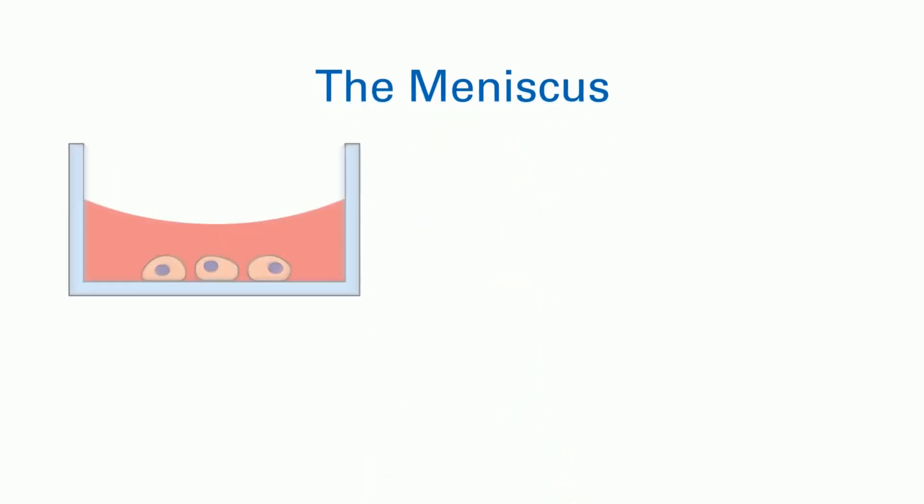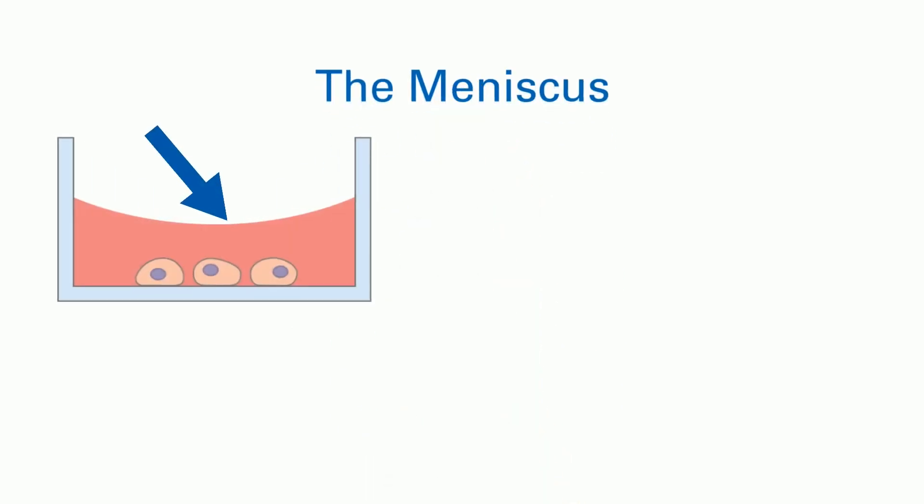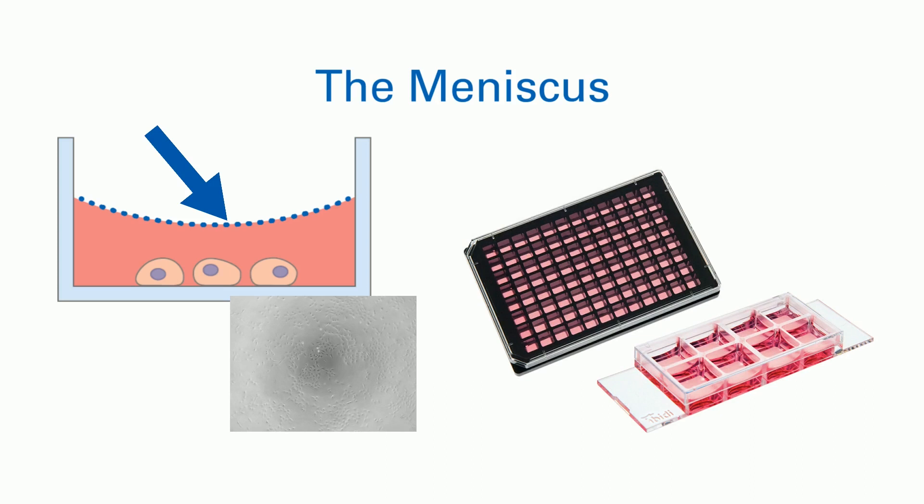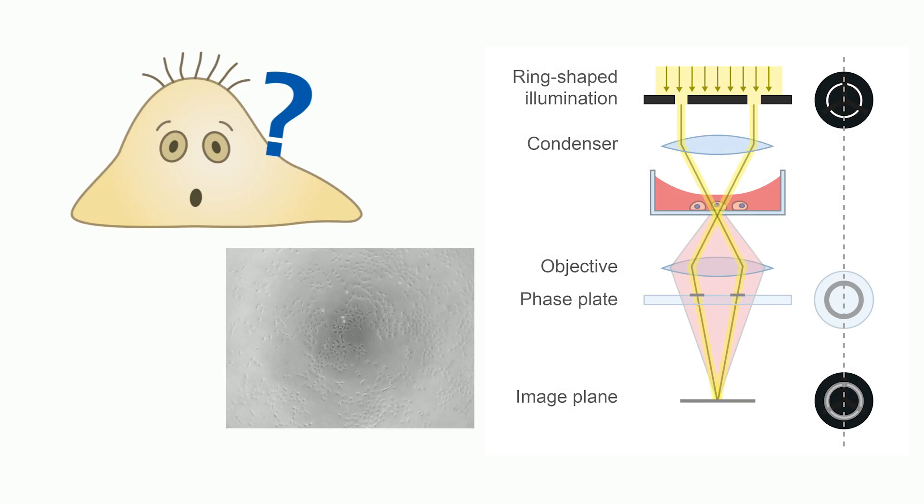The meniscus. The meniscus formation of the air-water interface is a natural effect that can disturb phase contrast microscopy when culturing cells in small wells. How does the meniscus cause blurry edges? The meniscus acts like a lens.